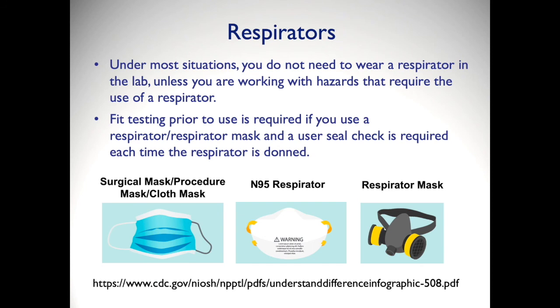Under most situations, you do not need to wear a respirator in the lab, unless you are working with hazards that require the use of a respirator. Fit testing prior to use is required if you use a respirator or respirator mask, and a user seal check is required each time the respirator is donned.